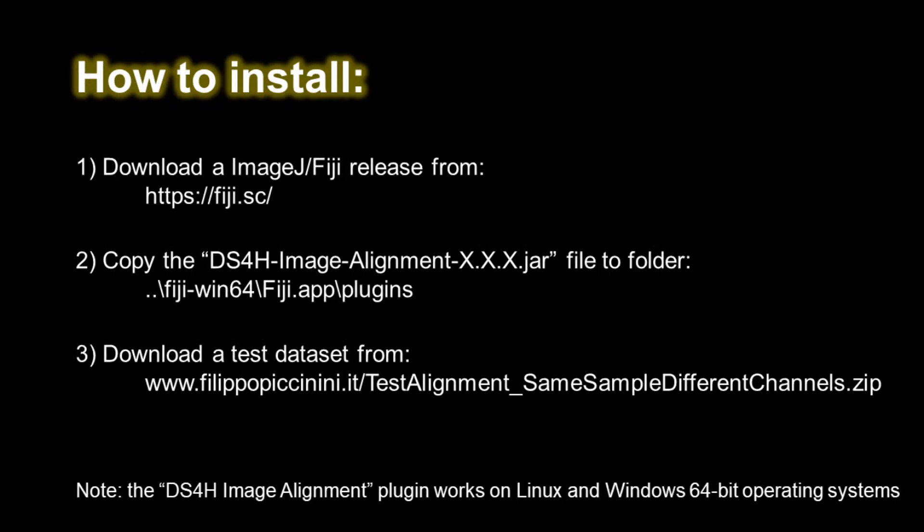In order to install the Image Alignment plugin, you must download a free version of Fiji at the official website and copy the JAR file of the plugin into the Plugins folder of Fiji.